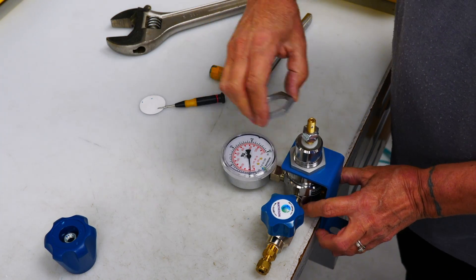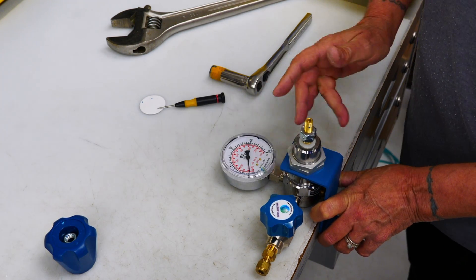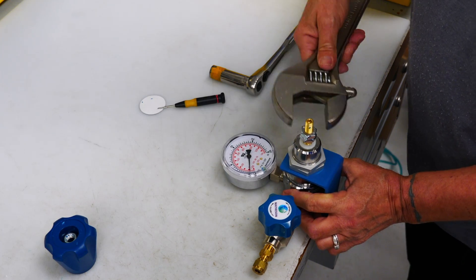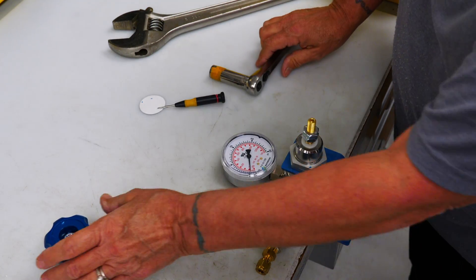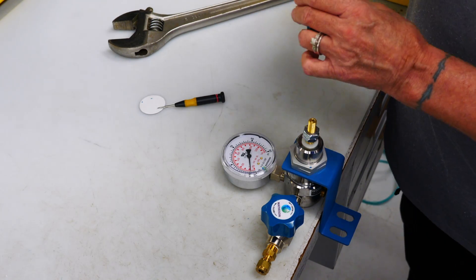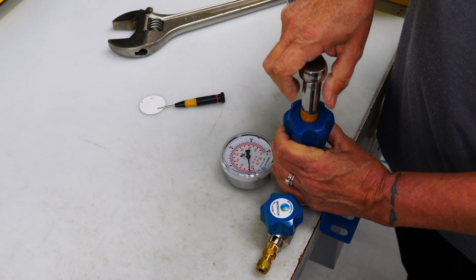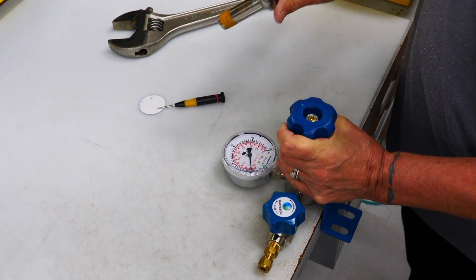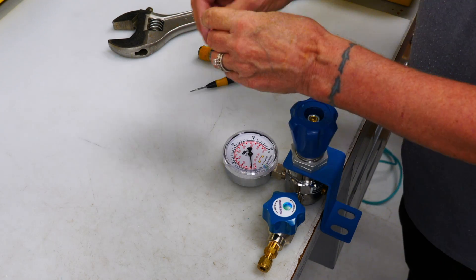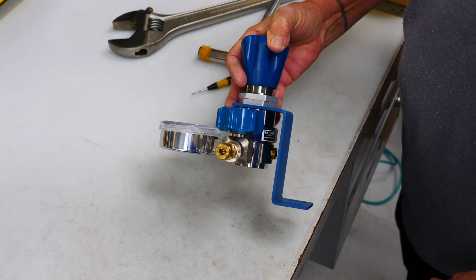Then you're going to take your other nut and put it on top. Tighten that. Then you're going to take your cap and put it back on. Tighten the nut and put the logo back on. There you go.